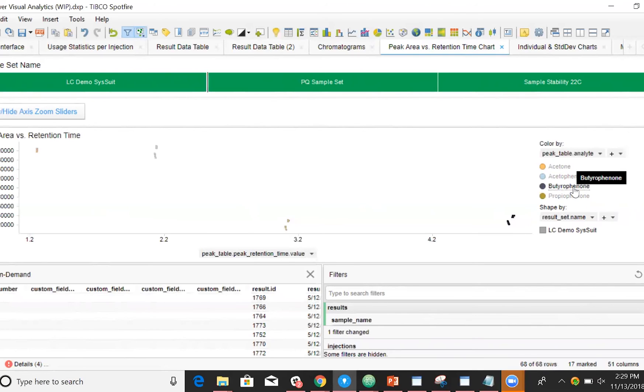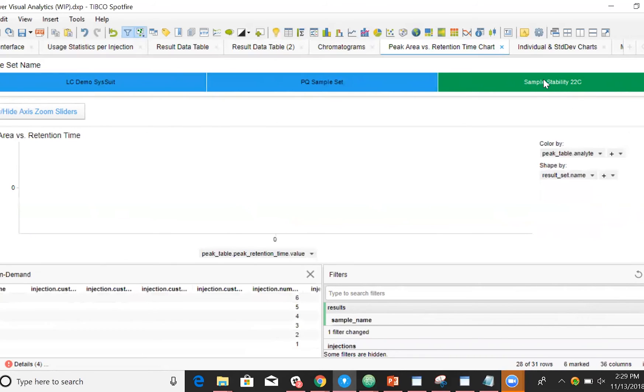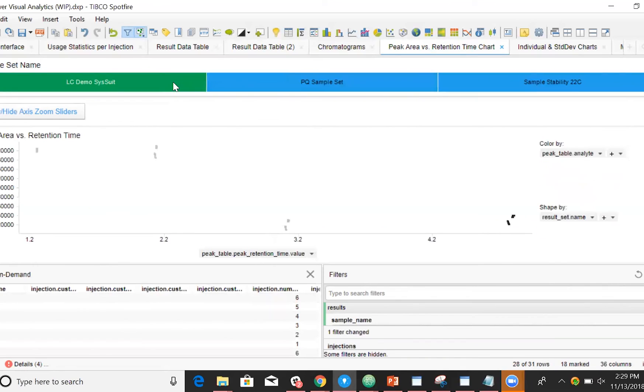We can build statistical aggregations, for example displaying the retention time versus the peak area. We can make selections for particular peaks or particular compounds, and we can make selections to only visualize peaks from a particular sample set.